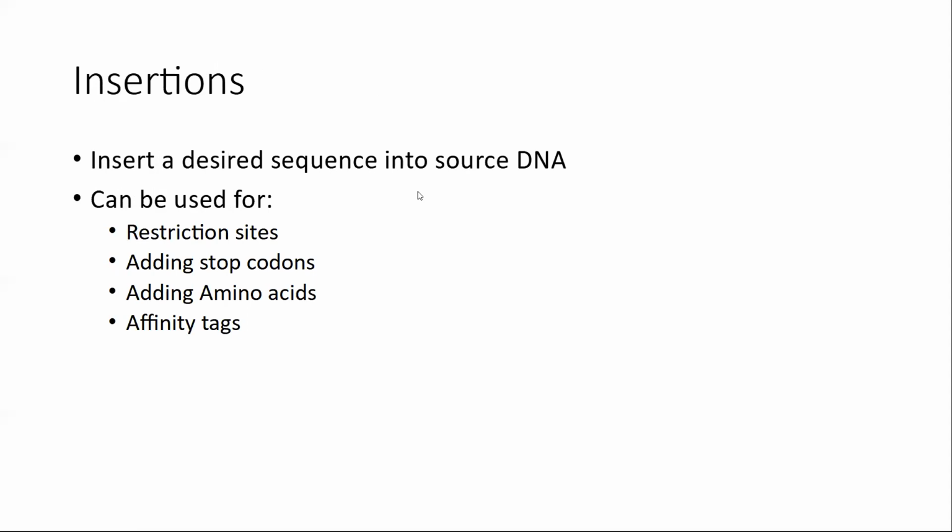So insertions are inserting a desired DNA sequence into the source DNA. This is effectively cutting and pasting in a particular sequence without modifying the things around it. Now, it should be remembered that inserting something, especially something that is longer than 3 nucleotides long, is going to cause frame shifting.